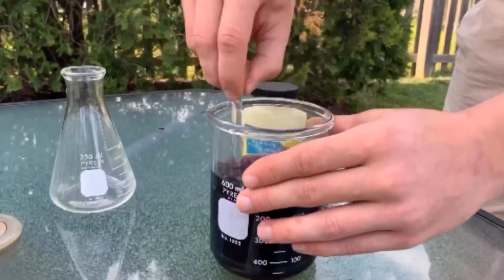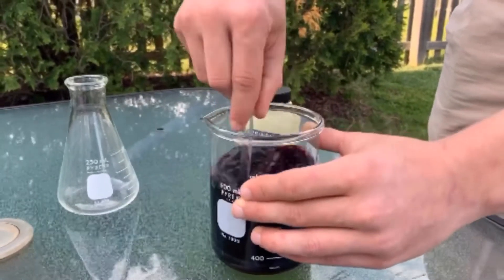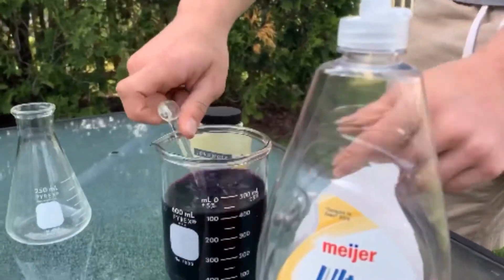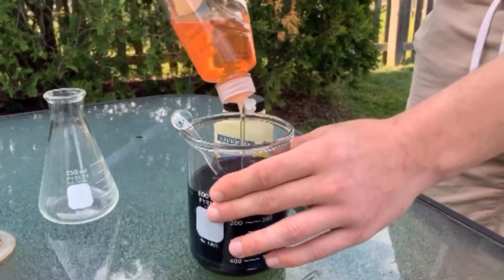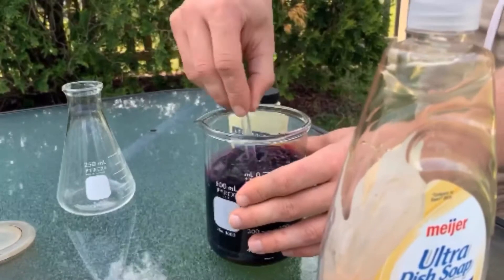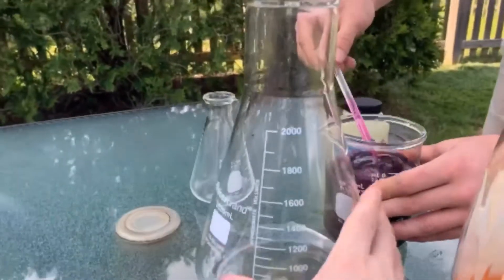Now, usually I use potassium iodide for this with food coloring, but I think the food coloring makes the solution too viscous, and I think the potassium permanganate will serve as a better catalyst. Then we're just going to use dish soap — Alex, just put a couple squirts of dish soap in there — and then mix that up. Now he's going to pour that into our 2,000 milliliter flask.